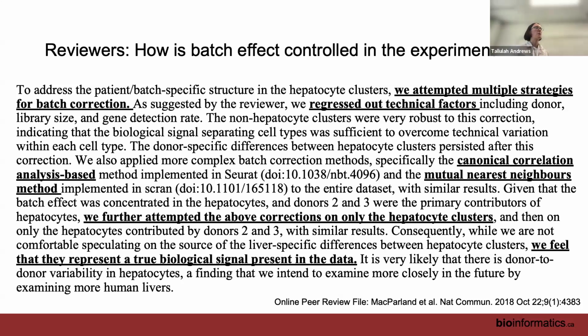So we concluded that these represent true biological signals. These livers are different between these different people for real biological reasons. We're just not sure exactly what those biological reasons are. So we did not end up doing batch effect correction for this data set in this paper.